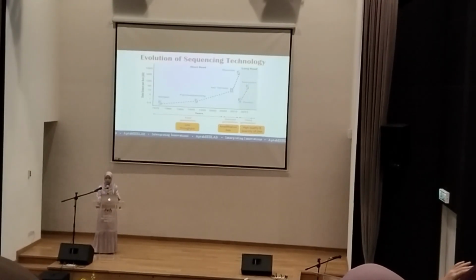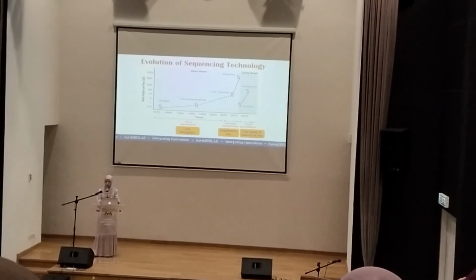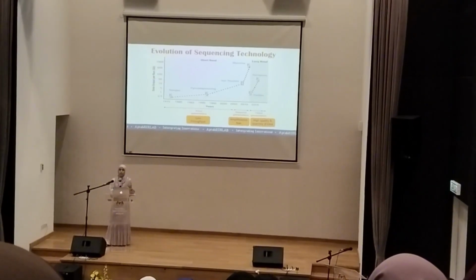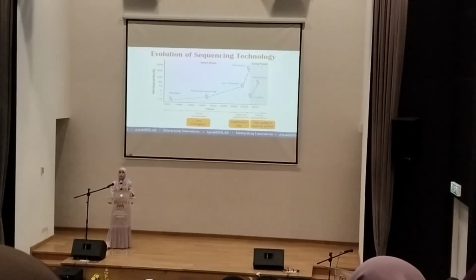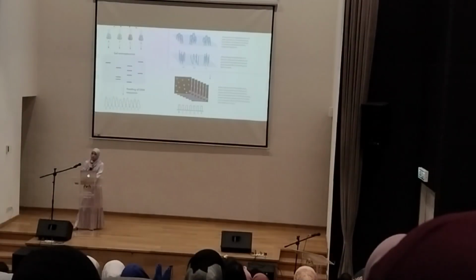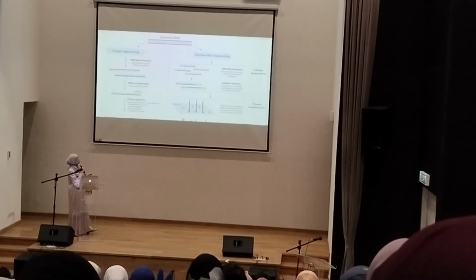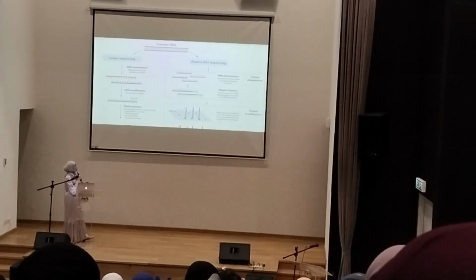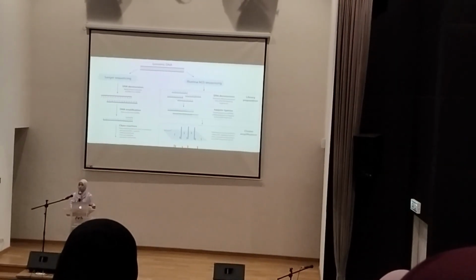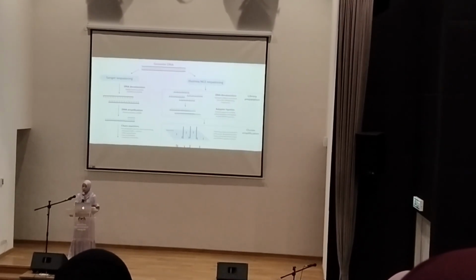Sequencing refers to the huge amount of DNA molecules that are able to be read at the same time. So this actually encounters the first problem of the first generation of sequencing. However, in NGS sequencing, besides the same library preparation of the denaturation of DNA, NGS sequencing also can be used for RNA.